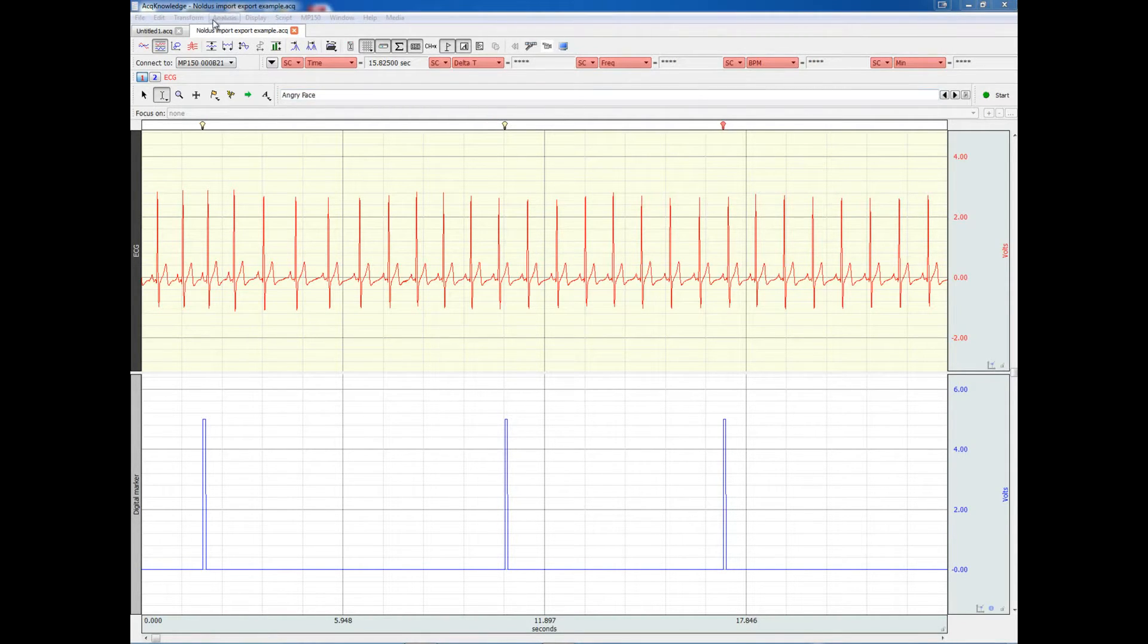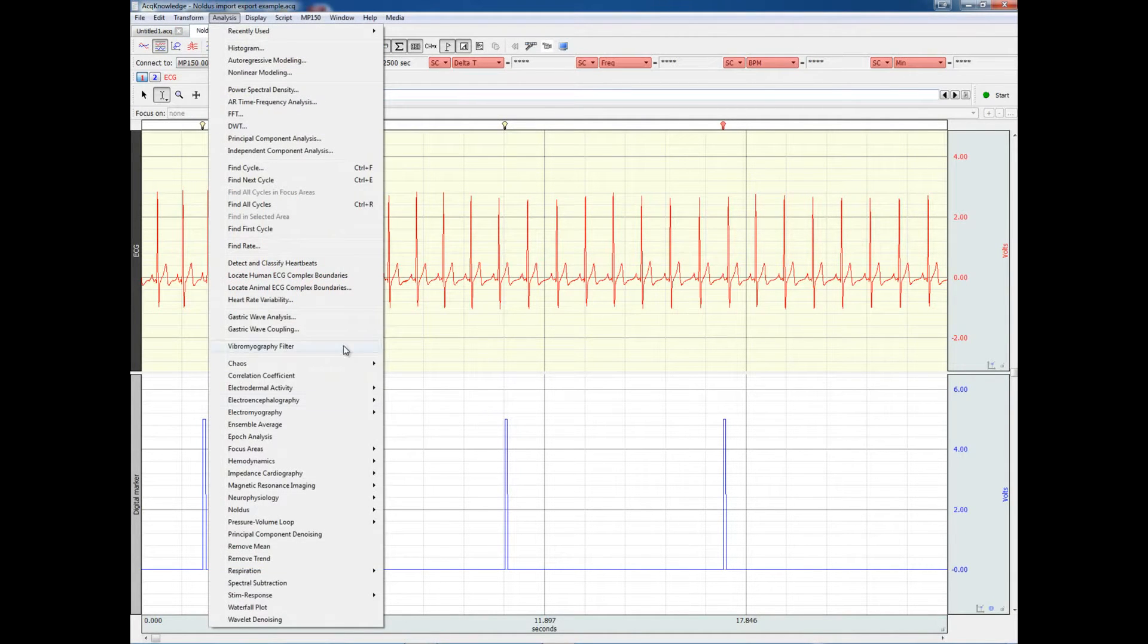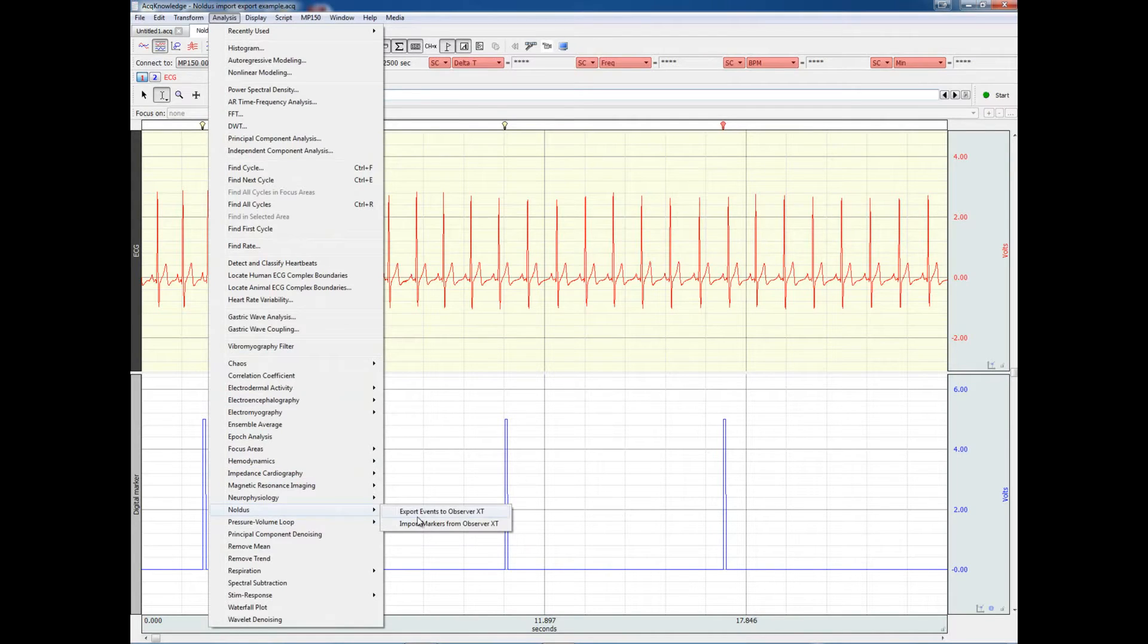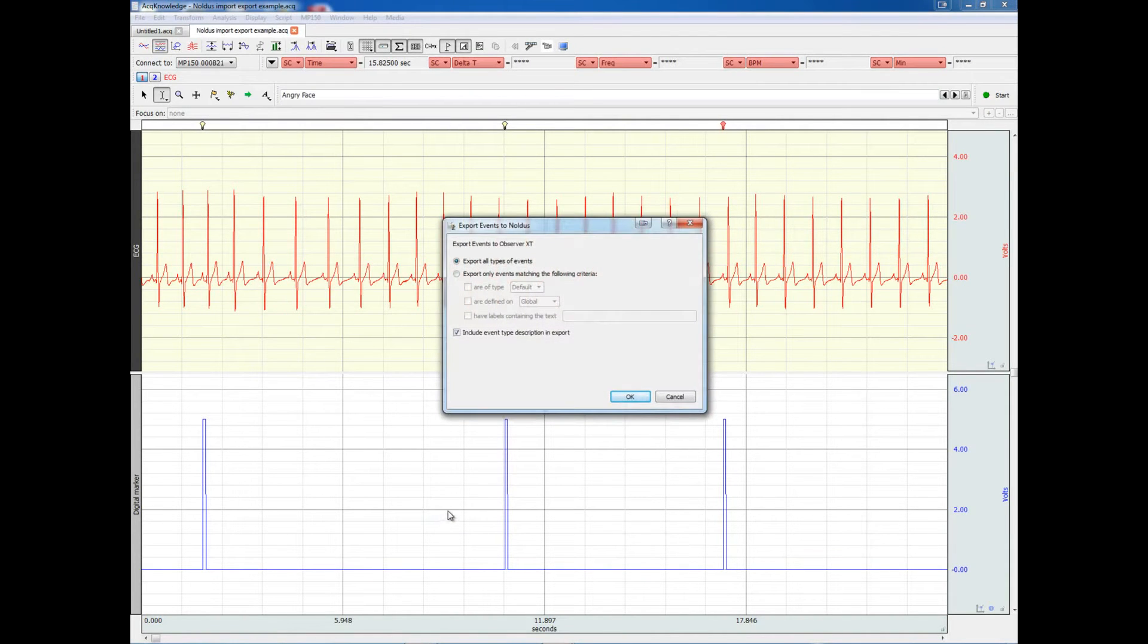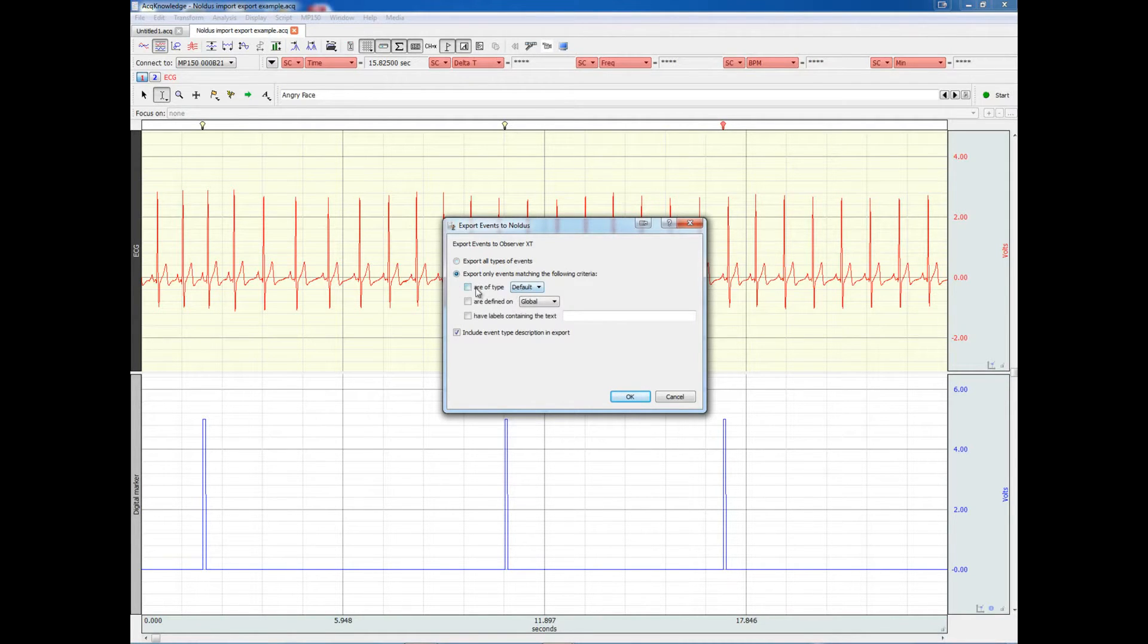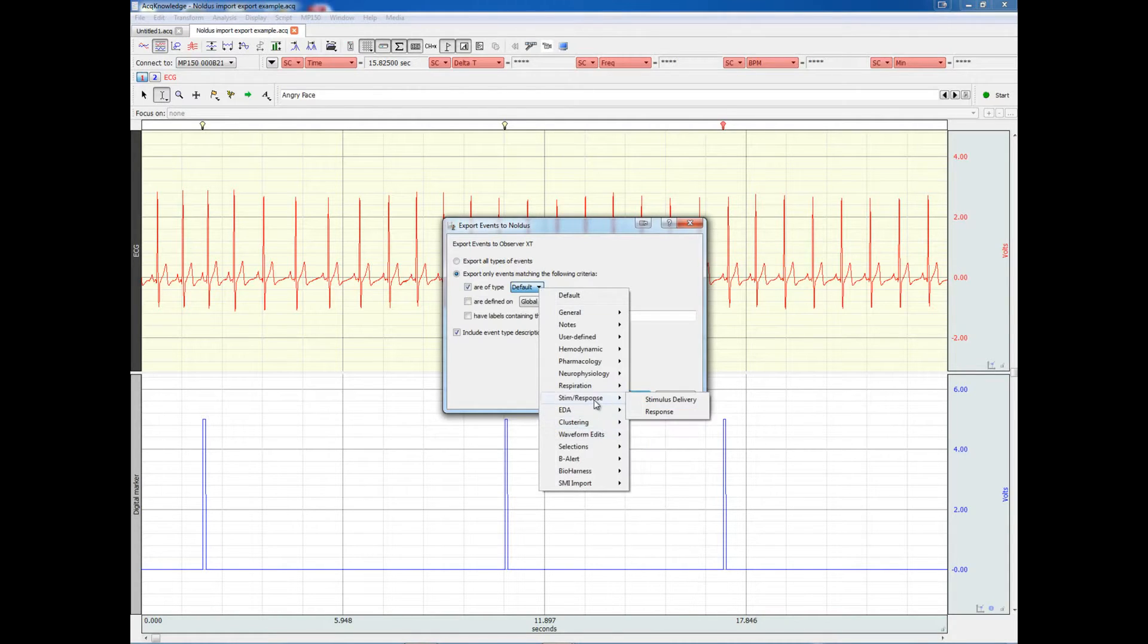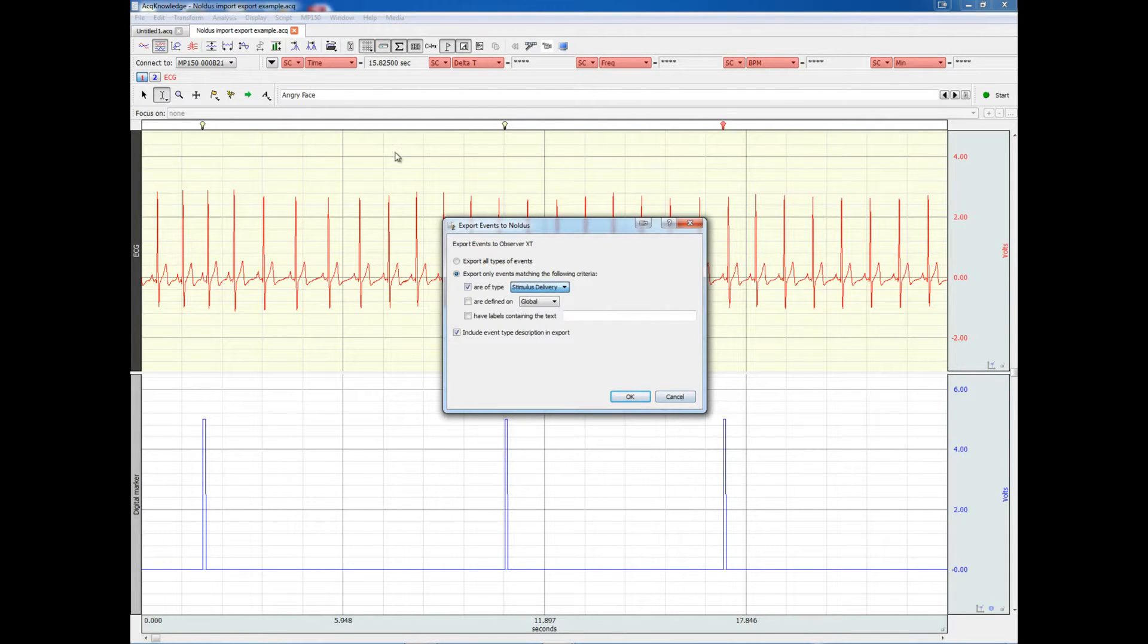To export the time and label of these markers to the Observer XT, we go under ANALYSIS, NODES, and choose EXPORT EVENTS to the Observer XT. We can export all the different events we have in the data file, or specifically the ones that are the stimulation delivery events, which is really what we want.